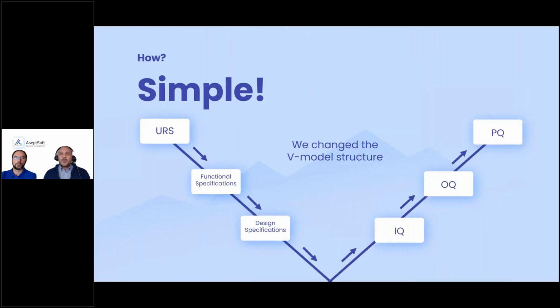So probably most of you are familiar with the V model. Starting from the URS written by the end user, the documentation flow goes step by step through the functional specifications, design specifications, and after through the validation documents like IQ, OQ, and PQ. Any technical modification during the FAT, SAT, or later is a nightmare.